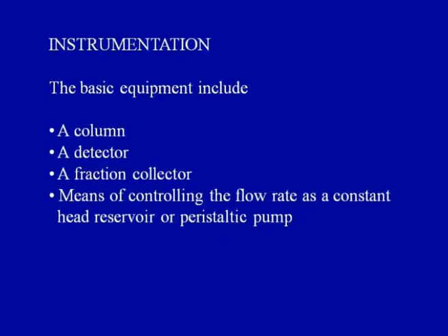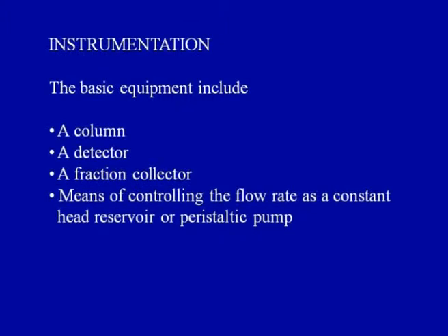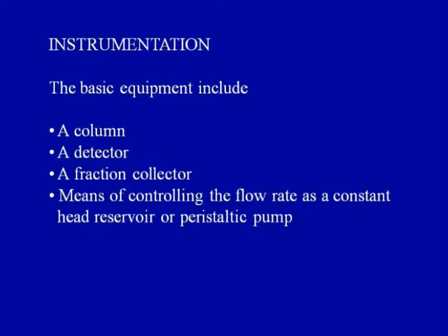You require a detector so that you can follow the peaks as they come and see the purification visually. Then you require a fraction collector to collect the different peaks separately. Then the flow rate has to be controlled. You can have a constant head reservoir, but that is not very suitable. What you require is a pumping system. It could be a peristaltic pump for low pressure, or for high pressure a constant displacement or other pumps could be utilized.